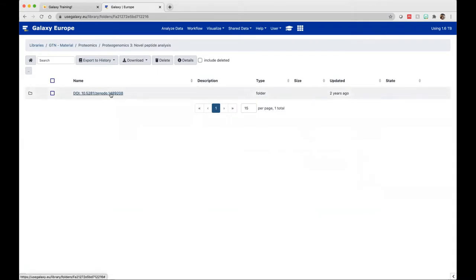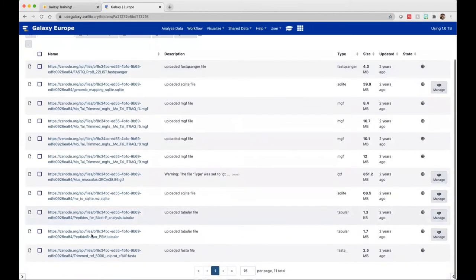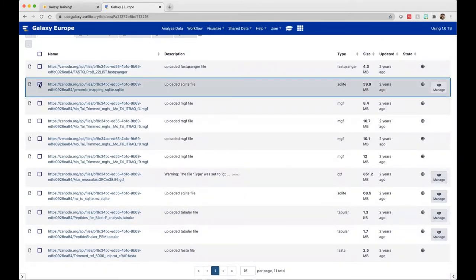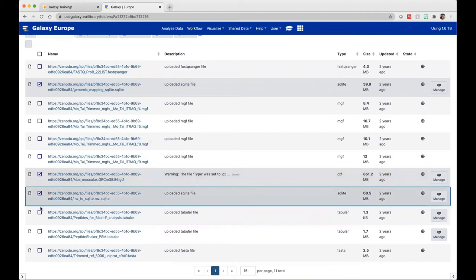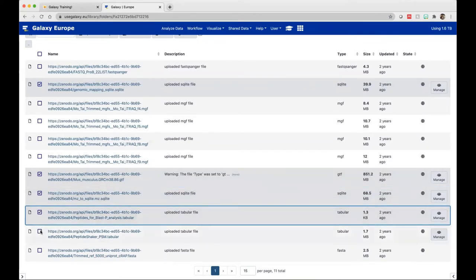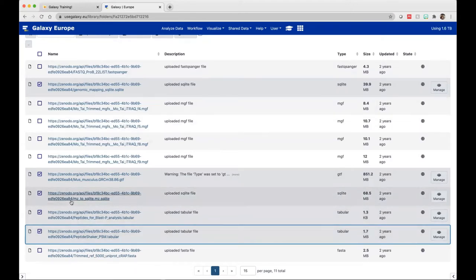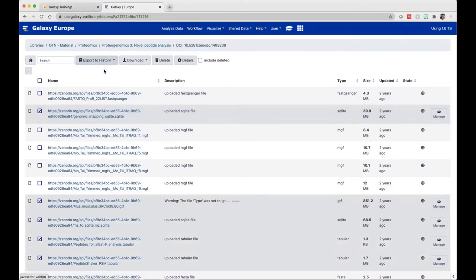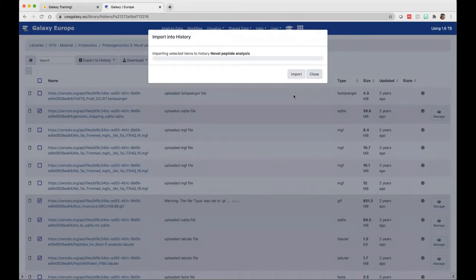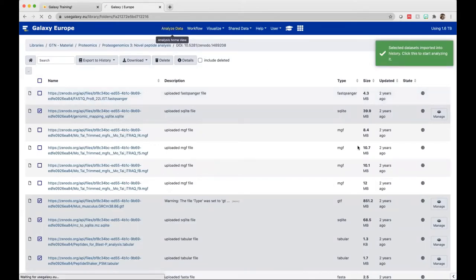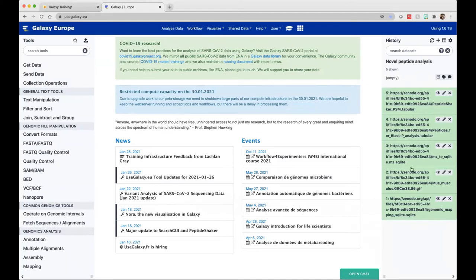Once you select that, select the Zenodo link there. The files we need to run the third workflow are the genomic mapping file, the Mus musculus GTF file, the mz2sqlite, the peptides for BLAST-P analysis, and the PSM tabular report. Once you select all, you can export to history as datasets and name your history as 'novel peptide analysis.' If you go to analyze data, all the files imported from shared data libraries will be right there.